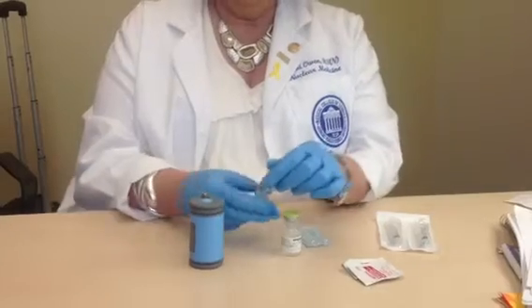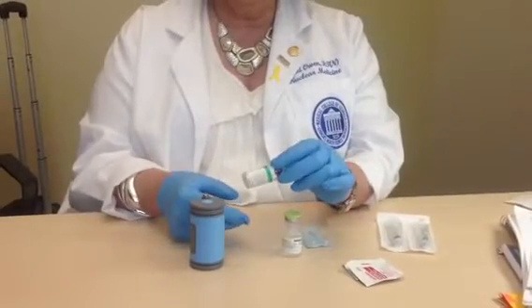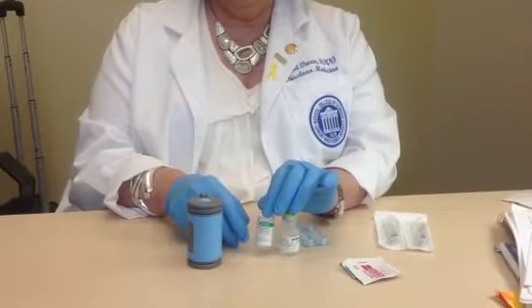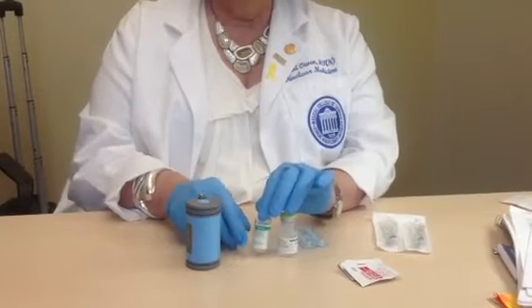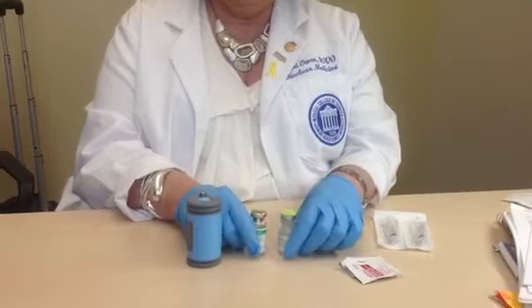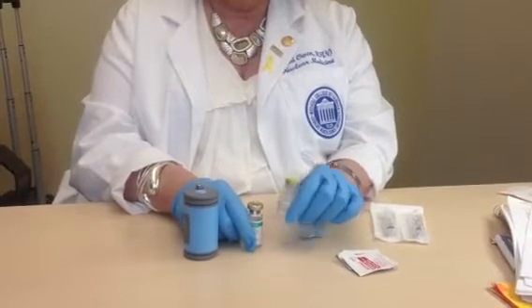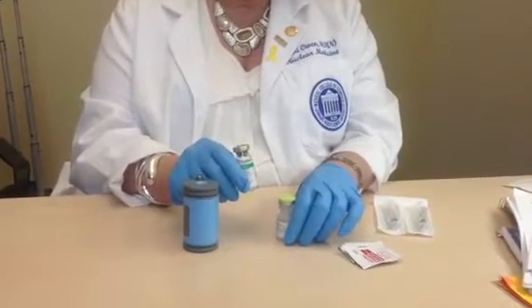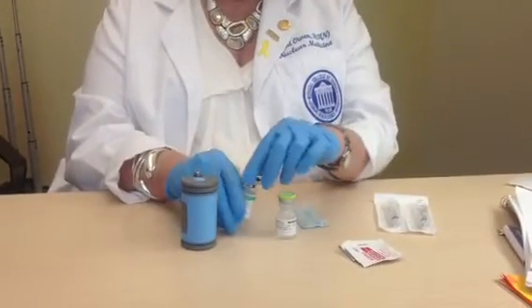And then we have a kit reaction vial. This particular one is for DMSA, which would be a renal imaging drug, and we're going to pretend that we're going to reconstitute, add the radioactive portion to the non-radioactive pharmaceutical.